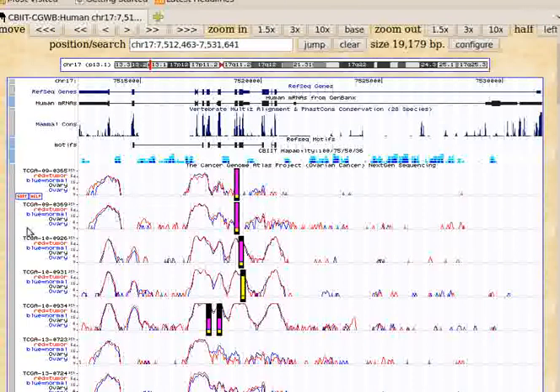There are different ways of viewing coverage. This view basically scales the coverage by log scale. The first line is 4x coverage, then 16, 64, and 256. The red lines indicate the coverage for the tumor samples, and the blue lines are for the normal samples. So in cases when there's a copy number variation, you could see if there's any distance between the tumor and normal, indicating whether there's amplification or deletion happening in the tumor sample.